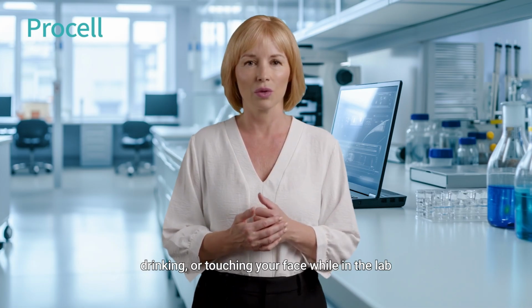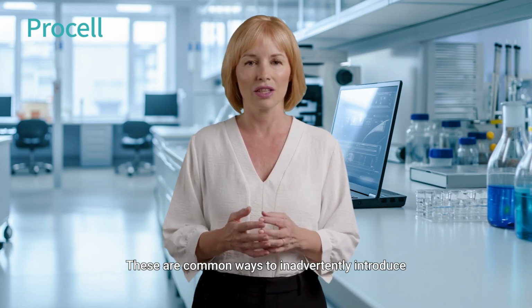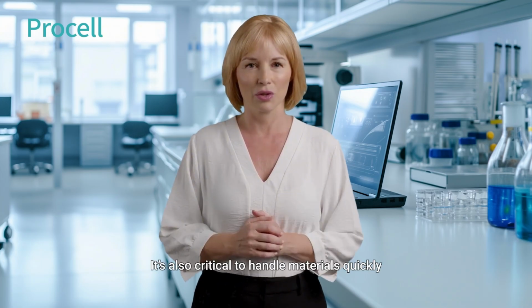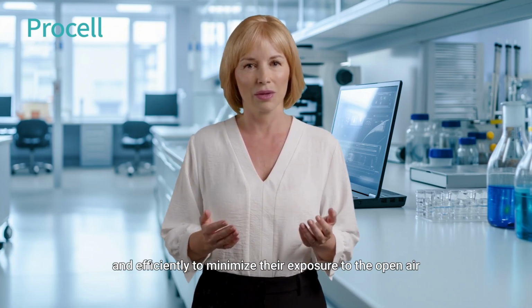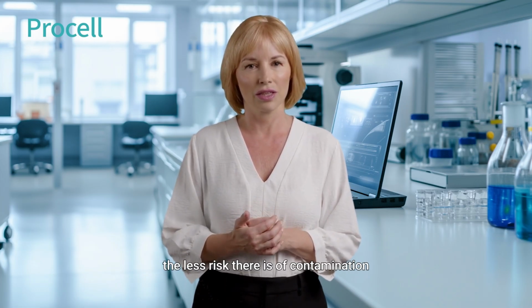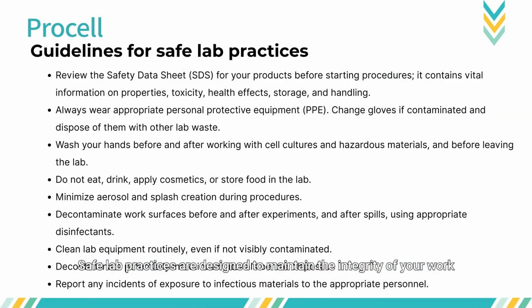Equally important is avoiding eating, drinking, or touching your face while in the lab. These are common ways to inadvertently introduce contamination to your sterile environment. It's also critical to handle materials quickly and efficiently to minimize their exposure to the open air. The less time they're exposed, the less risk there is of contamination. Safe lab practices are designed to maintain the integrity of your work and protect everyone involved. By adhering to these practices, you create a safer, more sterile working environment.